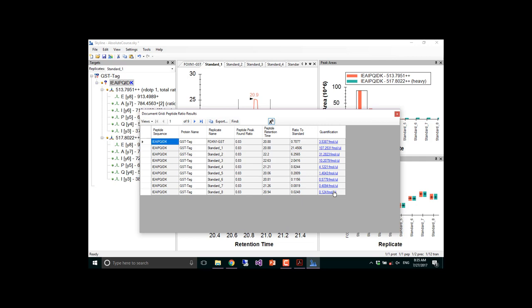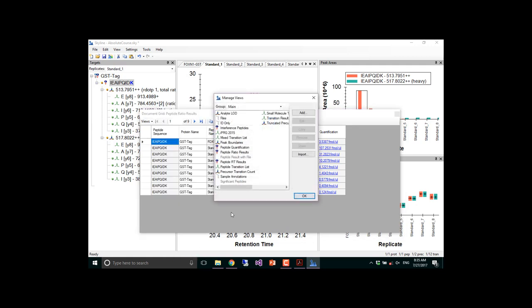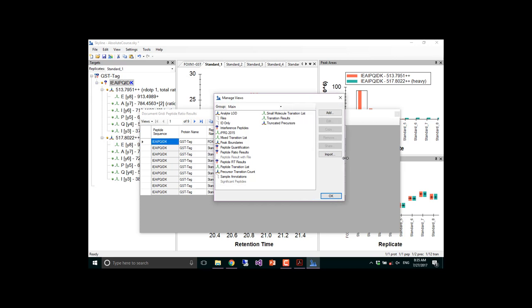Let's see, manage views. Why'd you do that? I don't know right at the moment.